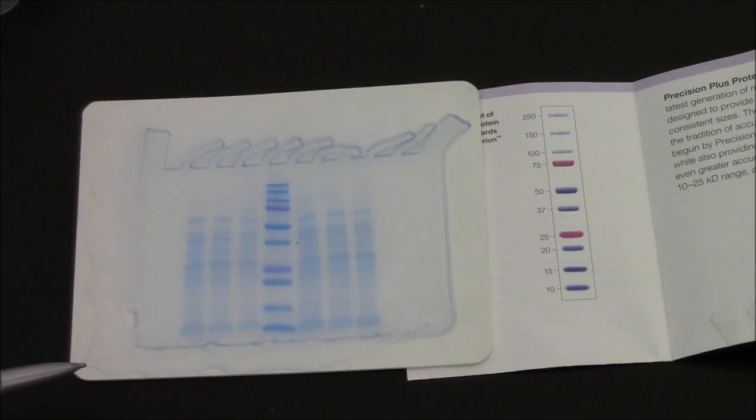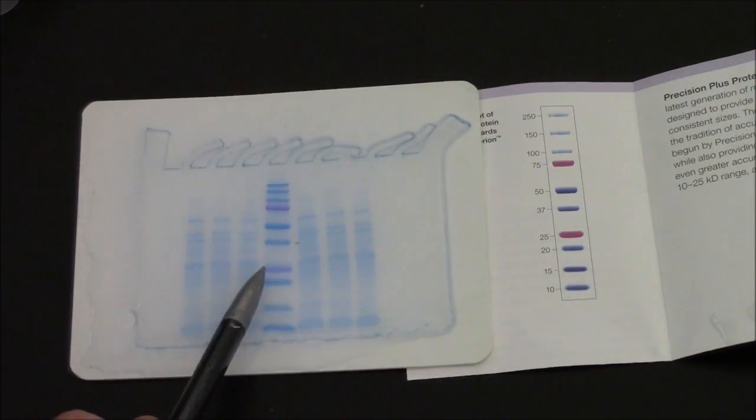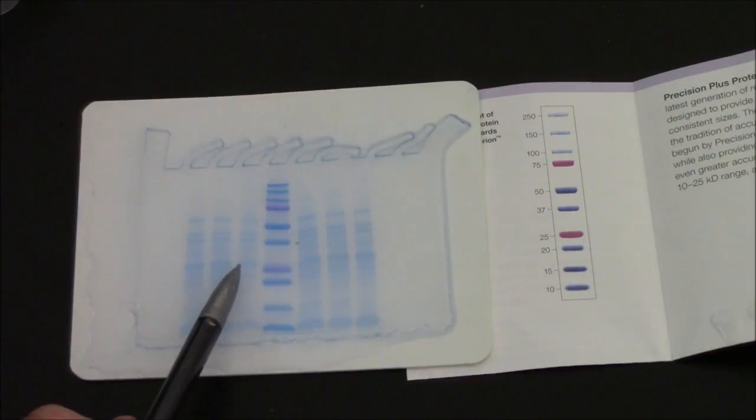The beta-lactamase itself, the enzyme we're looking for, is 27 kilodaltons. So I go to the 25 and the 37. Here's the 25, here's the 37. I'm thinking it's this band right here.